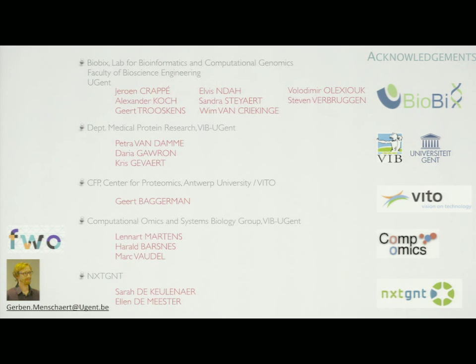Thank you so much. I have one question. When you measure those cells, mRNA or ribosome-based mRNA, what's the size difference? Are they very similar? Well, these ribosome-protected fragments are around 30 base pairs. So is the overlap to the mRNA database 90%? mRNA is the complete mRNA. Ribosome profiling is the coding sequence. It should be similar to the mRNA which is actually being translated. So we're talking about the coding sequence if we measure with ribosome profiling. So all the UTRs are gone, let's say, which is quite a part of your mRNA in some cases.